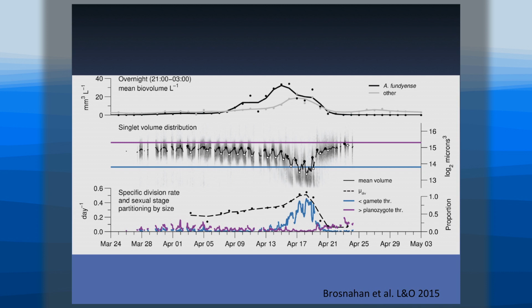So what do I mean? This is just an example of the bloom in one particular year as tabulated by the IFCB, where, again, it's being done in volume. We've turned cell counts into volume. It's the same thing. So among the things we can observe here, this is now the volume of the singlets, those single cells I showed you. It can be multiple types, but any single cell of Alexandrium, what's its volume? And you can see that it goes up and down and up and down and up and down. And you see this is nighttime and daytime, nighttime, daytime, nighttime, daytime.